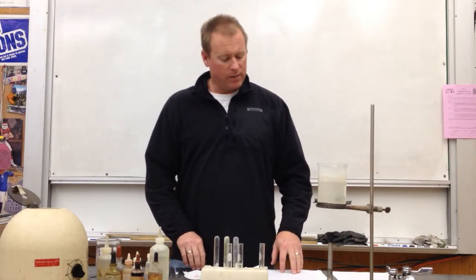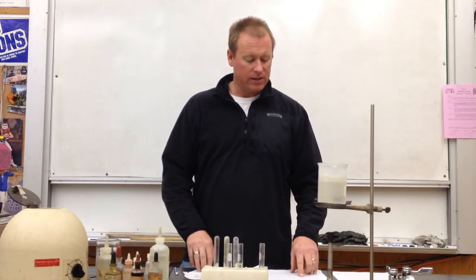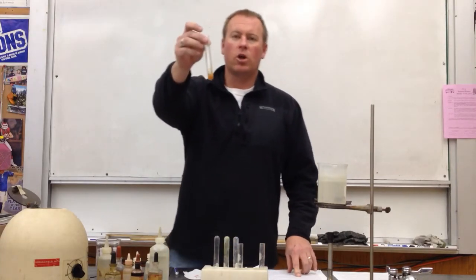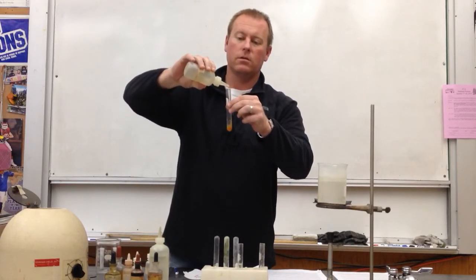Okay, we're ready to begin step 6 of the procedure. It says to dissolve the precipitate, meaning the precipitate that we got at the end of step 5, by adding 10 drops of HCl and stirring. So here's our rust-colored precipitate. We're going to find the HCl, hydrochloric acid, and add 10 drops.